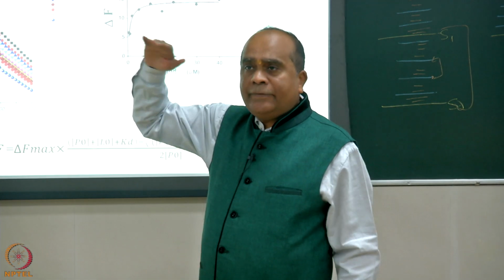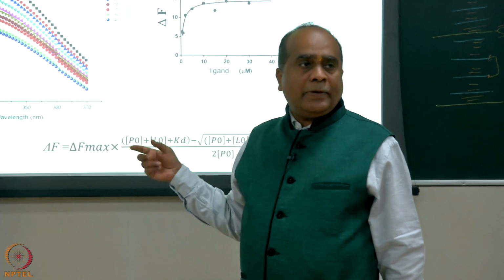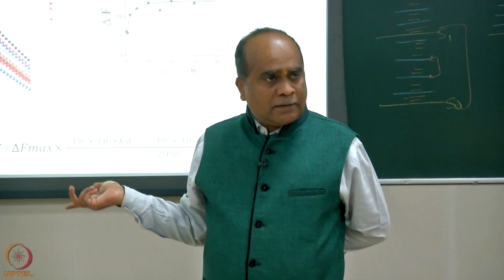Delta F means free tubulin versus drug-bound tubulin. You are plotting it against ligand to find out the Kd of the drug which is binding with tubulin. That was your question? Sir, go ahead. In a simple form, if I have a tubulin which is labeled with fluorescence, whether it is bound or not bound, it is still there in the system, I will still get the signal, so how am I plotting it like that?